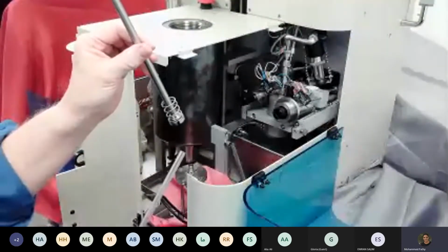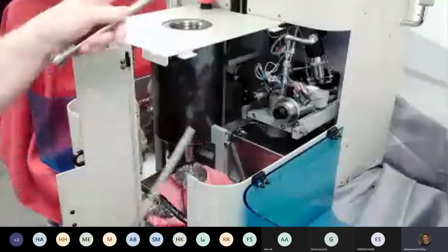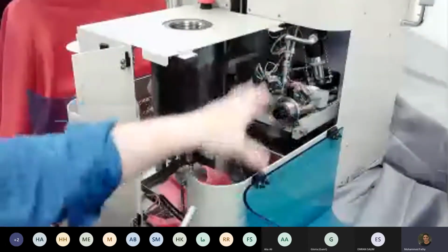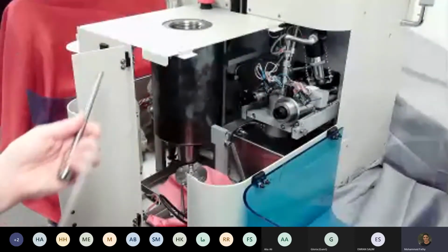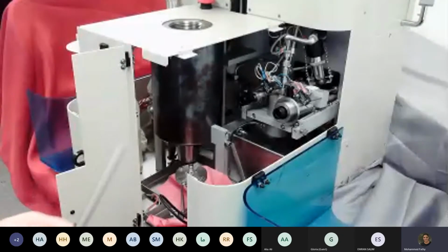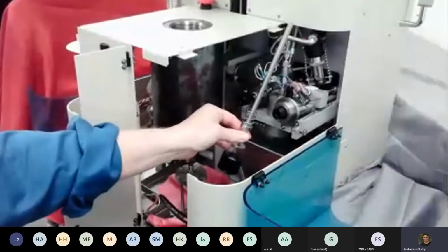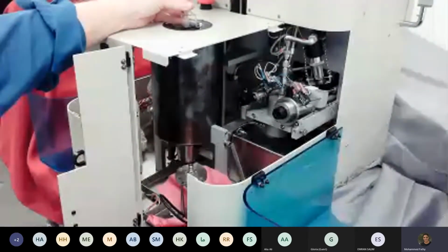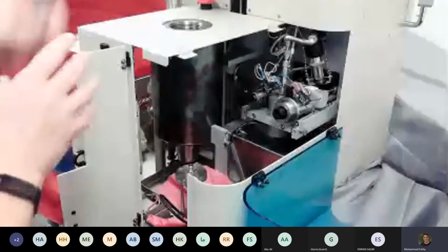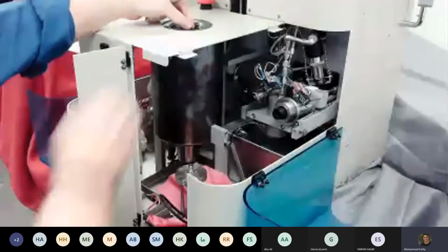The high pressure one is different because we have different sample cells to accommodate in the high pressure chamber. The geometry is a little bit different between high pressure and low pressure. So once this has been measured in the low pressure system, then it's transferred into the high pressure cavity over here. Let me just drop that down there. That's going to sit down in here.